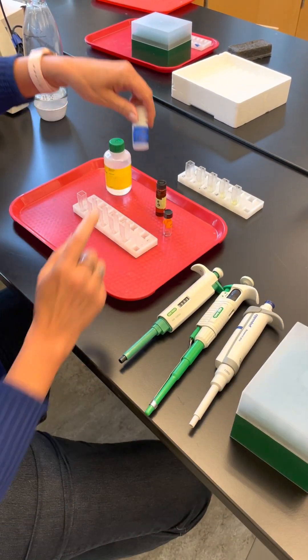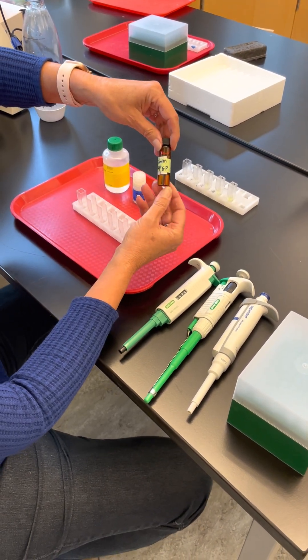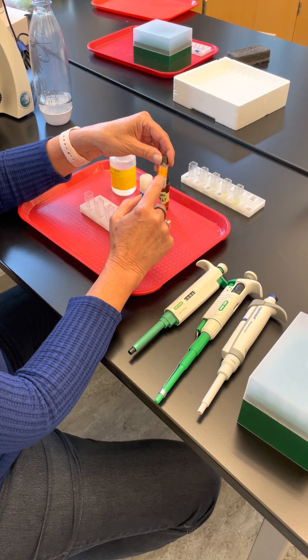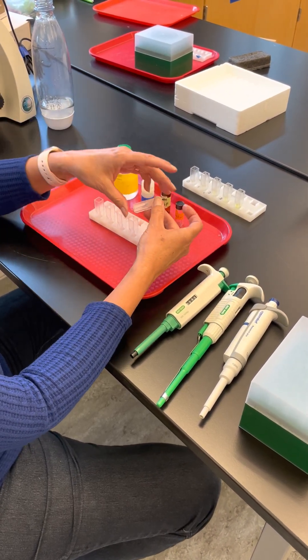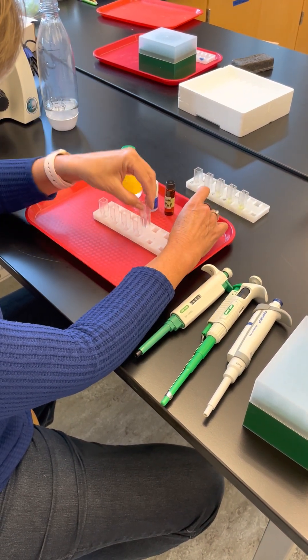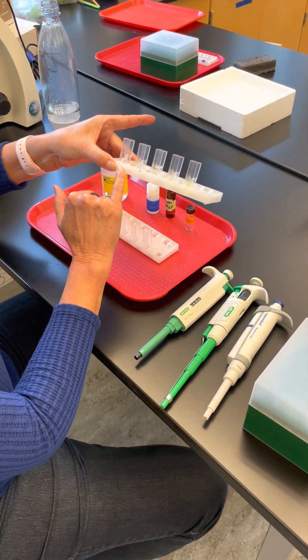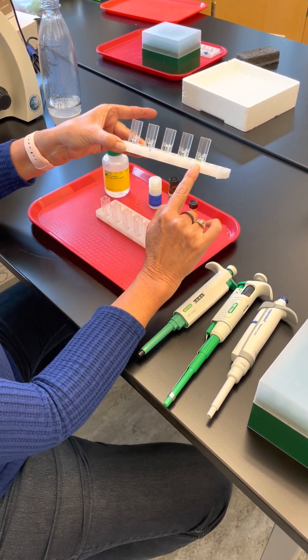We have a bottle of the enzyme and a bottle of the substrate, which is the reactant of the reaction. This little bottle is where your reaction will actually happen, and these are called cuvettes. The reaction produces a product that, when you put it in the stop solution, will turn yellow. Here you can see a series of tubes getting more and more yellow as time goes on.